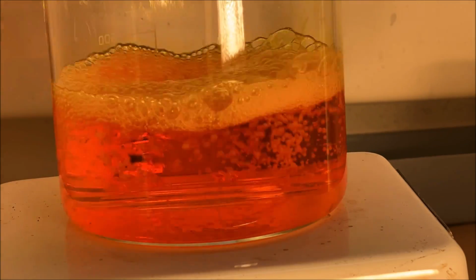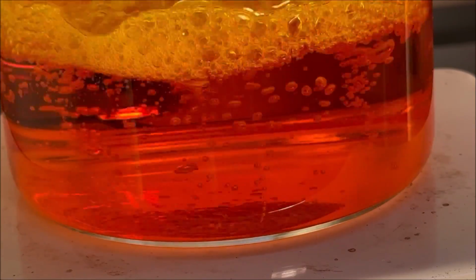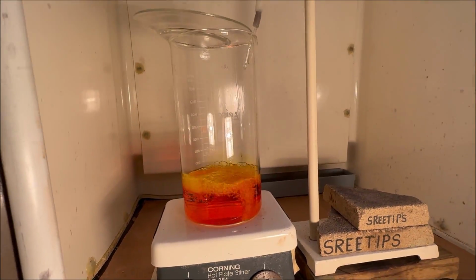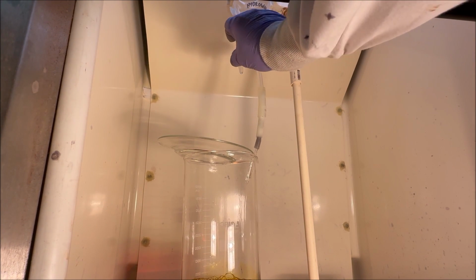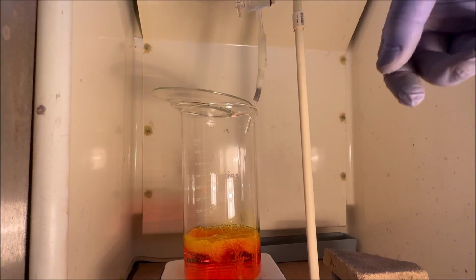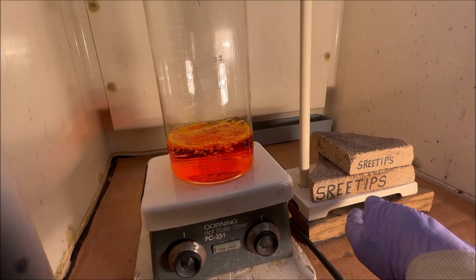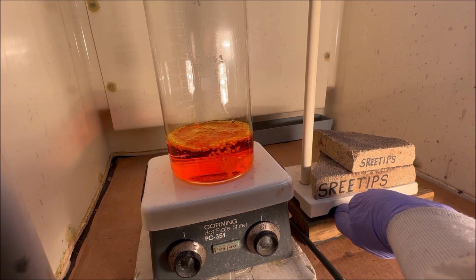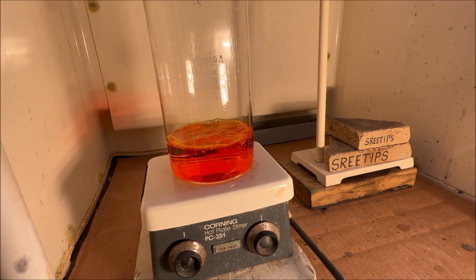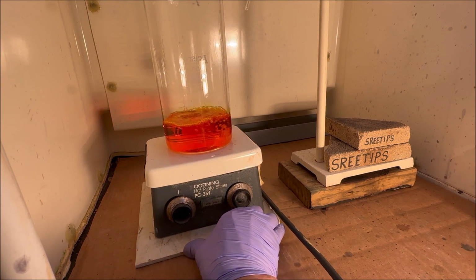I believe everything has gone into solution. There may be a few tiny pieces that haven't dissolved yet, but I'm going to call it here. Let's turn our hydrogen peroxide off. Turn the heat off down here. Let me move my delivery apparatus out of the way. Just push it back out of the way. Now we'll scoot this back ever so carefully.